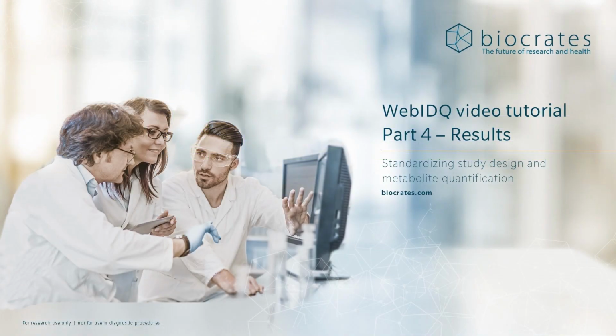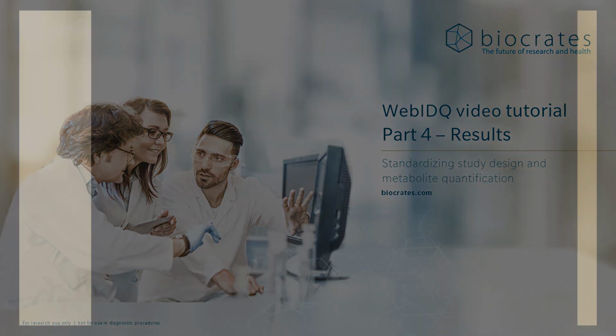This concludes the final video in the WebIDQ tutorials. In this section, we looked at how to load the kit data results, customize the display, normalize the quality controls, and add metabolism indicators before exporting. For additional information, please review the online WebIDQ user manual or contact Biocrates support whenever you have any questions.